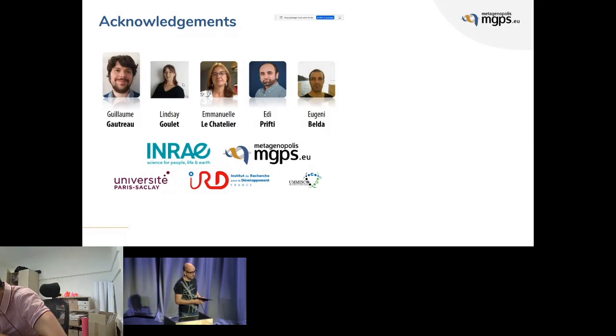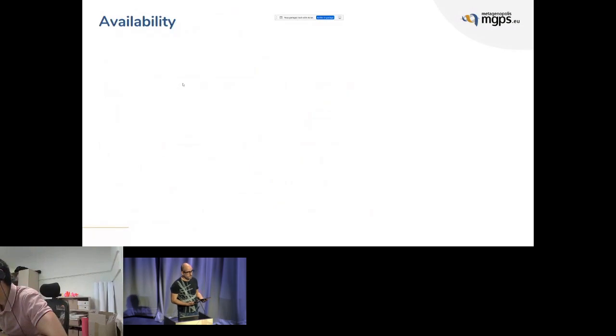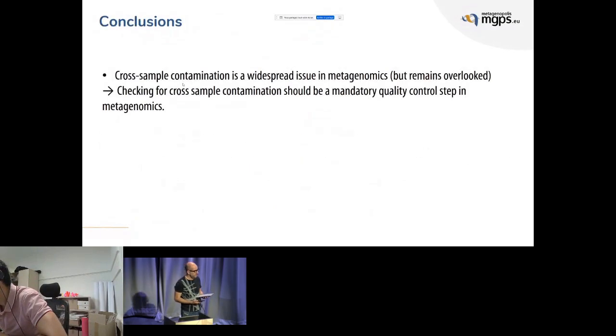Okay, so cross-sample contamination is an important problem and definitely happens. But when it does, it's most often barcode switching, in my experience. And that's going to mix up more than pairwise samples. If barcode switching is happening on a run, your samples will be composed of contaminants from multiple other samples. And I don't see that your method can identify that.